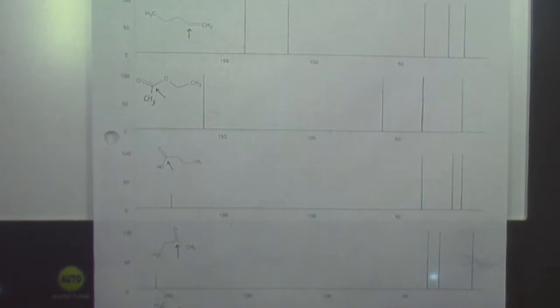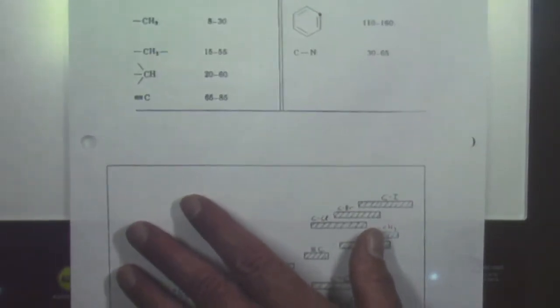That is a really distinctive peak because very few things actually show up that far downfield. So that sheet was really just to give you some sense that carbons do move over that whole chemical shift axis, and that sets you up for this.